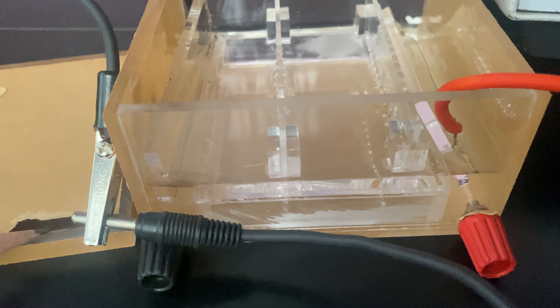On the side you connect it to the main power. The chamber cover is removable for a better view. It has gel combs provided with it. Please visit the website www.abronexports.com or write to us at abron01@gmail.com.